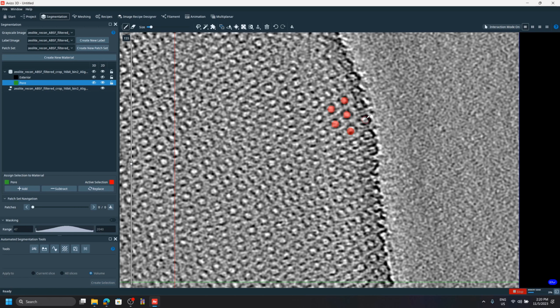And just look at this. So I'm now doing the manual segmentation, right? This is the human input. And I'm not gonna do all of this slice, but just a few. And I'm not an expert here, so I'm just using my judgment. And then I did the selection as usual, right? So you see the red highlights.